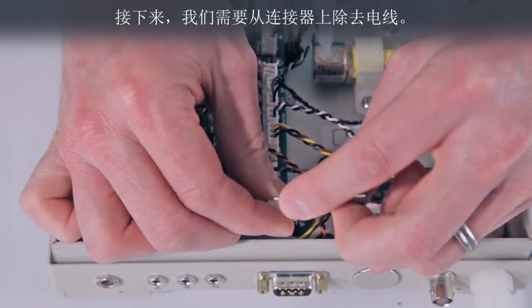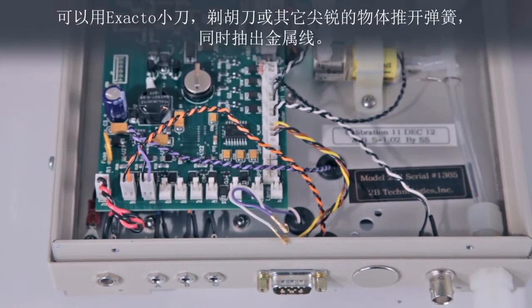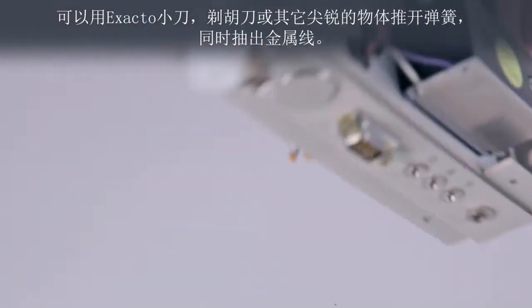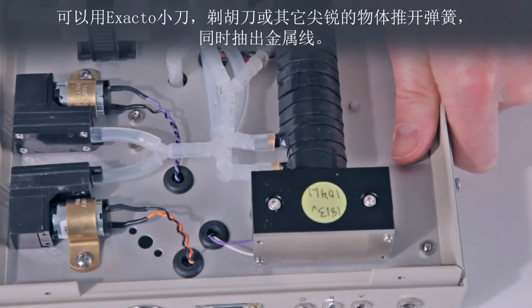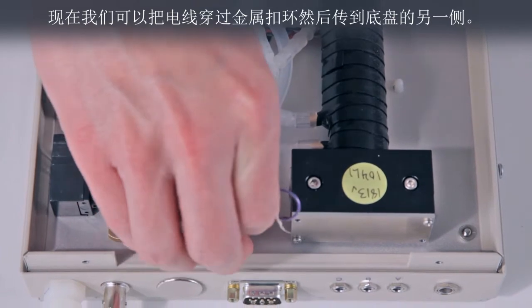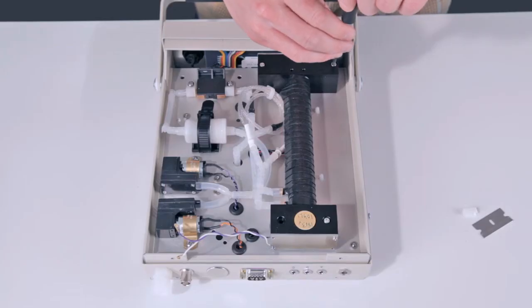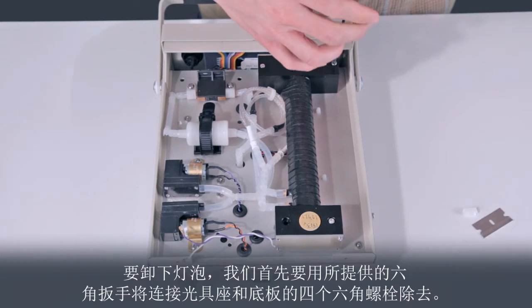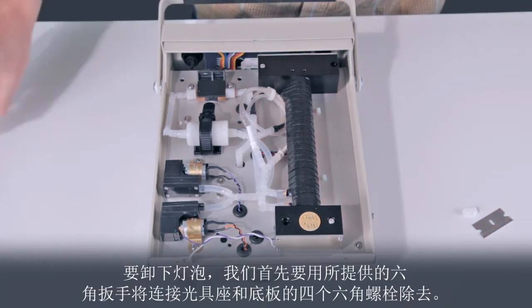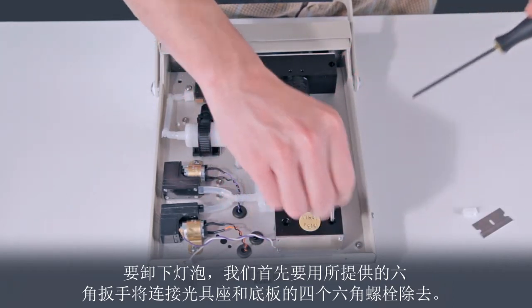Next, we need to remove the wires from the connector. This can be done with an exacto knife, razor blade, or other sharp object by pushing in the spring clip while withdrawing the wire. Now we can slide the wires through the grommet that passes the wires to the other side of the base plate. To remove the lamp, we first remove the four hex bolts that attach the optical bench to the base plate using the hex wrench provided with the ozone monitor.